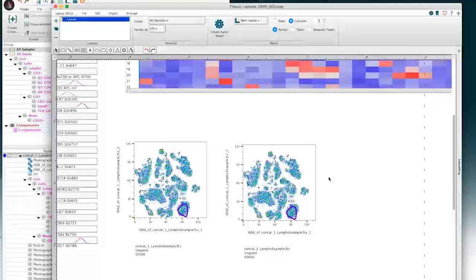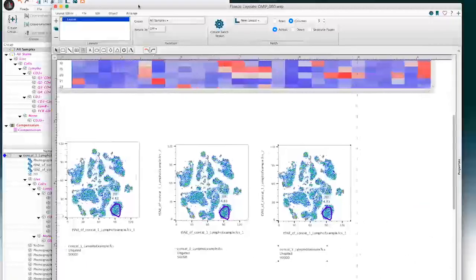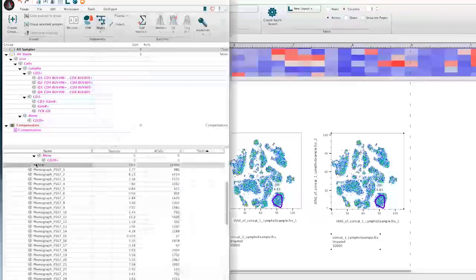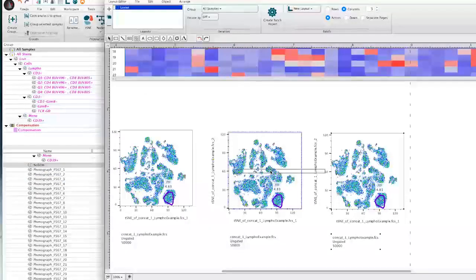If I duplicate this twice, then over here in the gating hierarchy, I'm going to drag and drop, replacing this everything event plot with just the no stim events. To do this, I'm dragging over like I was going to make an overlay, but before I drop it, I need to press the Option button and see the little plus show up on my cursor.